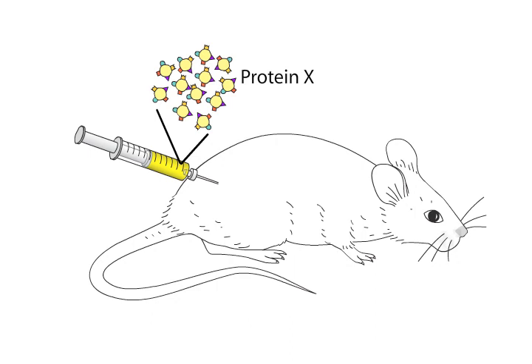The first step in preparing antibodies specific to protein X is to inject a mouse with a solution of the purified protein. Usually an adjuvant is added to the purified protein to boost the immune response. The size of the protein antigen can also affect the quality and quantity of the antibody produced. Small peptides are usually non-antigenic and need to be cross-linked or conjugated to another antigen to elicit an immune response.